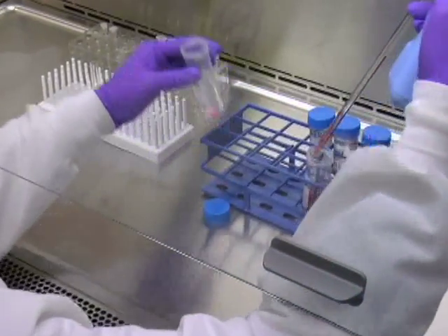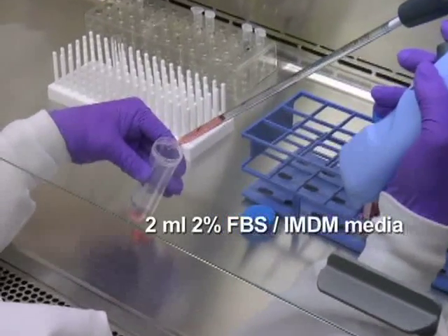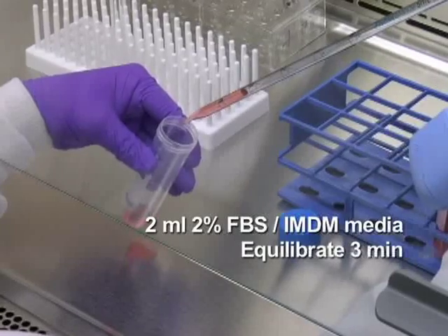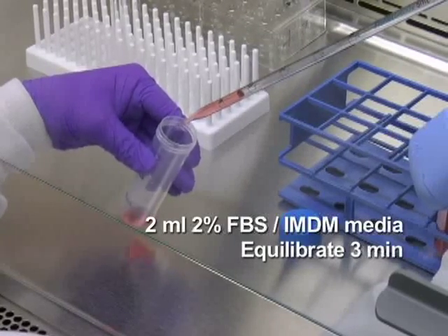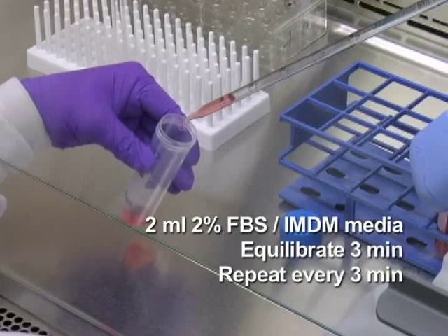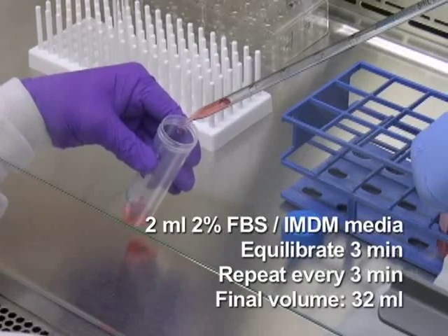Continue by slowly adding 2 milliliters of media while mixing gently and again equilibrate for 3 minutes. Repeat this procedure of adding media of equal volume to the diluted cell suspension at 3-minute intervals, swirling gently in between additions, until the final volume reaches 32 milliliters.